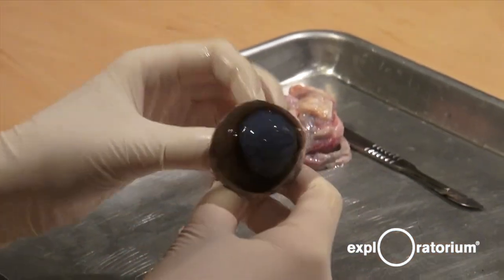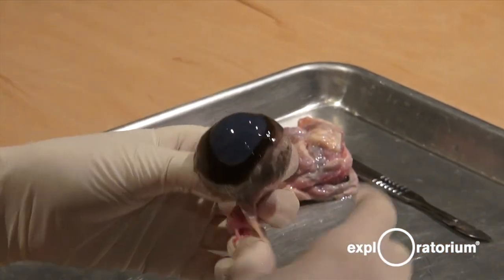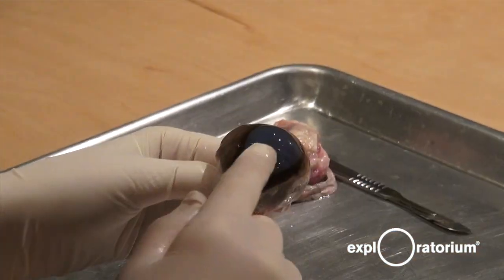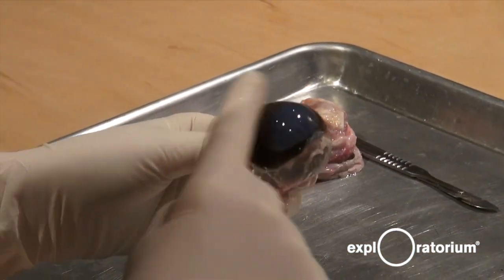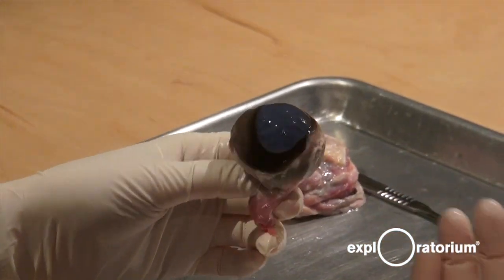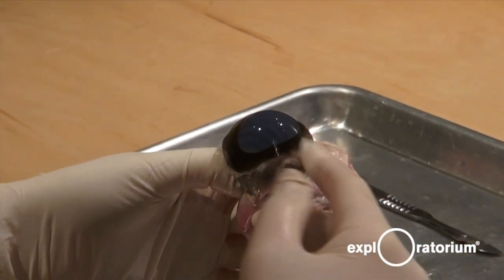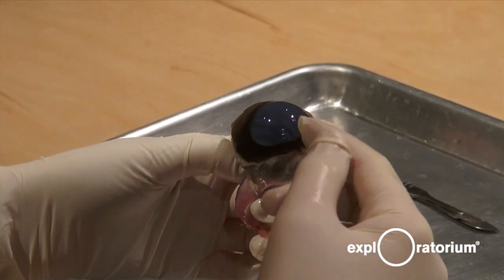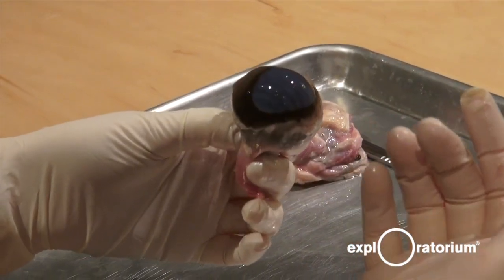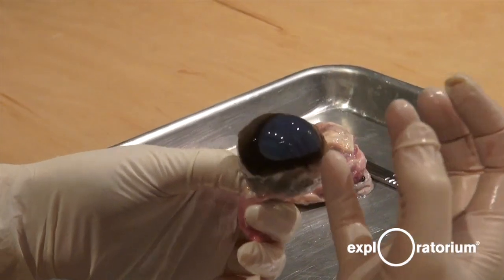Here we have our eyeball — it's a bit cleaner now. We're going to follow the path of light. Light enters through the cornea, which is this front part of the eye. It looks a little milky and bluish right now, but it's usually clear. This is so that light can pass through unimpeded — it's a bit like a window. But this cow is dead, the eyeball has started to decompose, so it's become discolored.